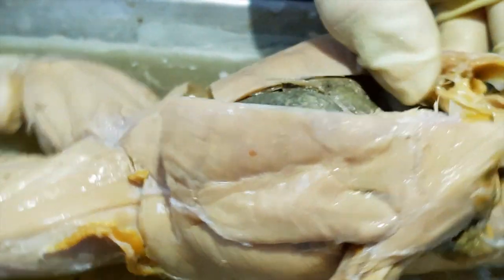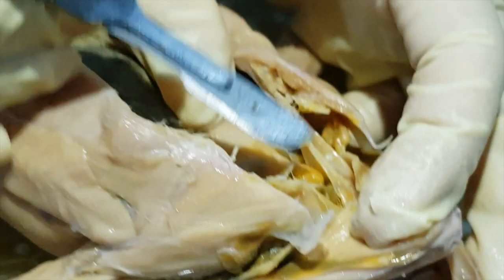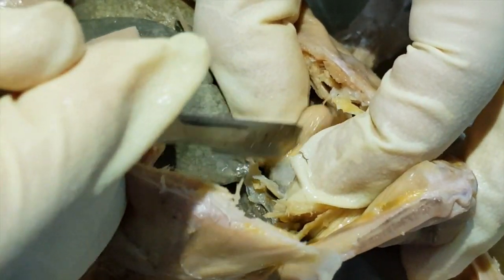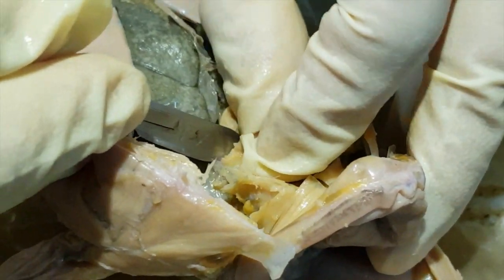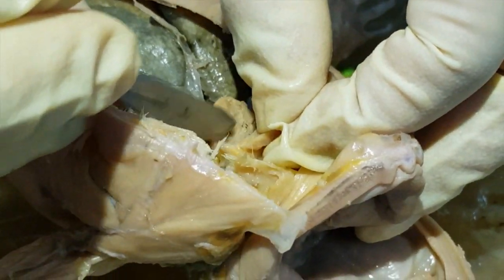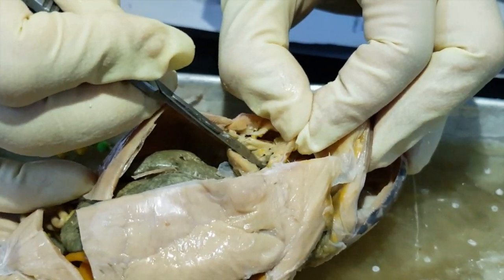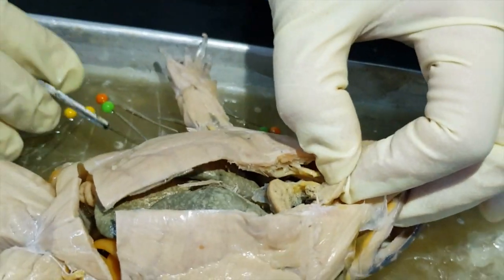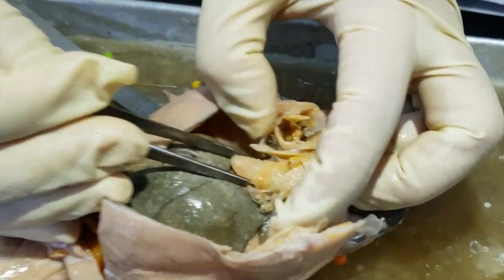I'm going to remove this. So this structure that I cut is the heart.